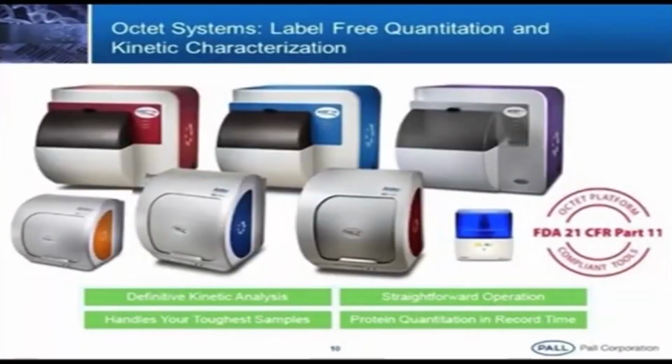So I will go through this. We have Pall Corporation, which has different platforms for designing experiments and performing discovery. From a single channel instrument, which is very small, you can hold it in one hand. It looks like our NanoDrop machine. Single channel, manually operated, one sample at a time.